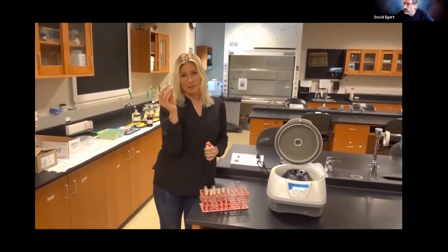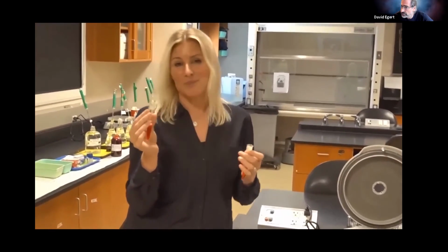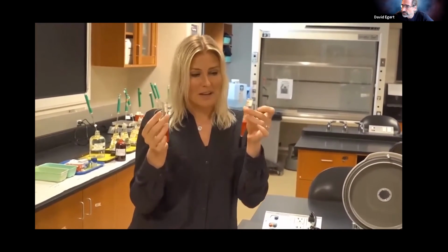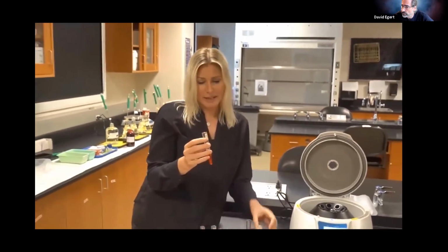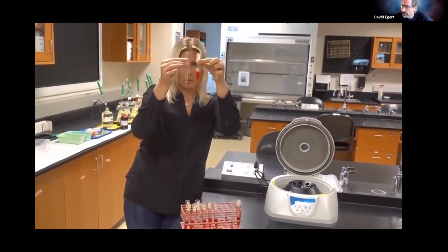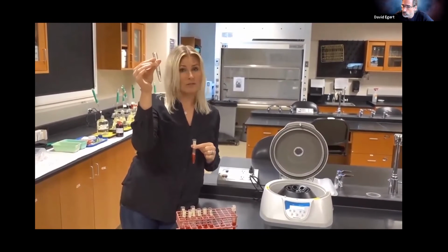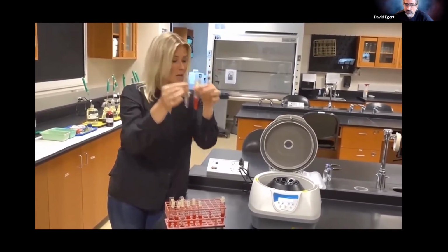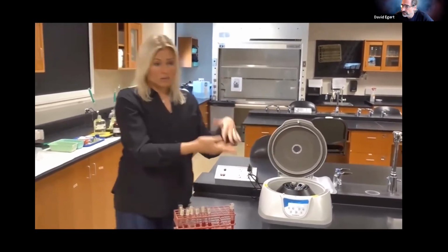So next, you guys would only have number 9 left, which is the glycerol. But remember that we're doing a special experiment where we left another glycerol in for a much longer time, so I have to balance the centrifuge. For you guys, you would only have this one, so you need to create a dummy tube that weighs the same. What I've done here is measure out 3 mL of water, and then add 6 drops of water to make sure they're exactly the same. You would put them right across from each other and do the whole process.